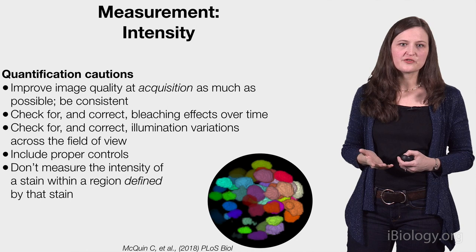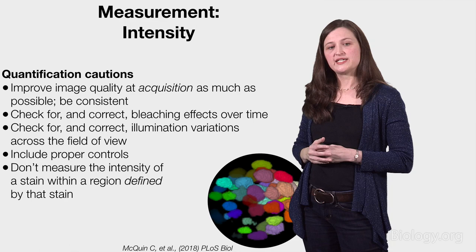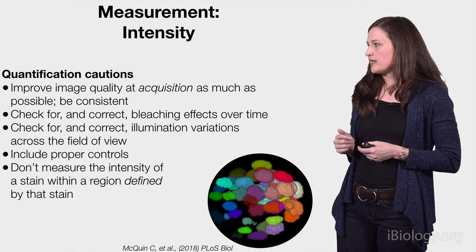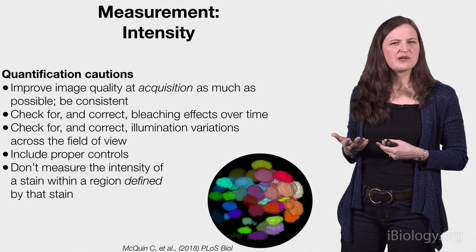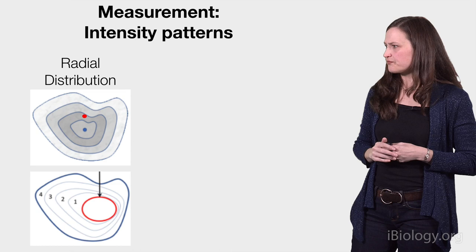And finally, a segmentation tip. Although there are exceptions, you generally don't want to measure the intensity of a stain within a region that's been defined by that stain. This can diminish true differences between samples, and it's a sort of selection bias, where you're only measuring the intensities in regions that have a certain minimum brightness. So that's something that generally needs to be avoided.